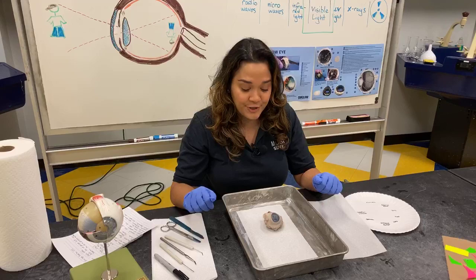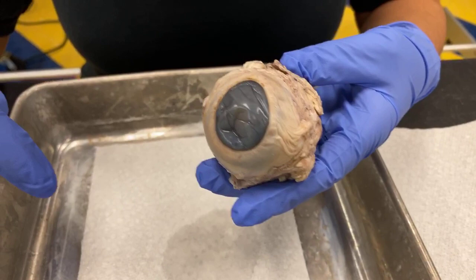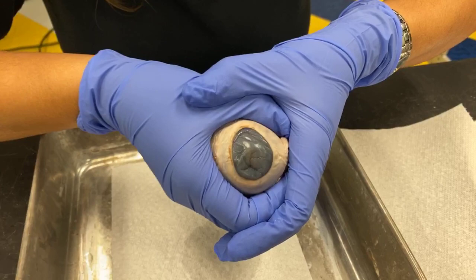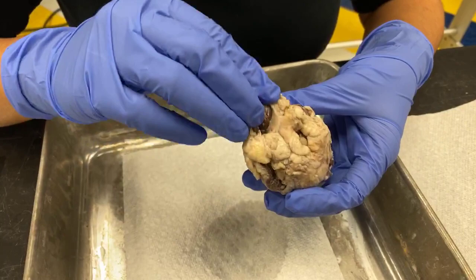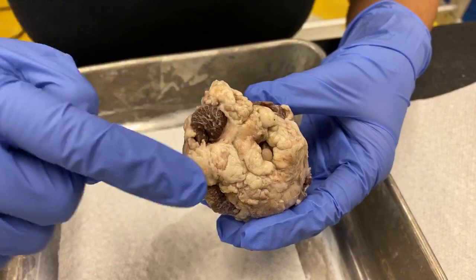So first, let's take a look at the front. That grayish spot, which would be clear on a live eye, is the cornea. This is the front of the eye — if this was in a cow, you'd be able to see that much. Now let's actually start at the back. There are a few important parts at the back we don't want to miss. This squishy yellowish-gray stuff is fat — cows as well as humans have a layer of fat that cushions and protects our eyes.